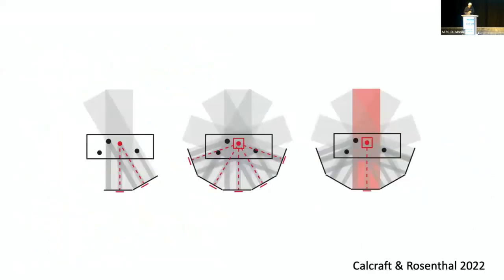Okay, now this is moving from the idea of these tilt pairs. We know there's an increasing focus on tomography, and of course there we're recording many images of the specimen, and in many instances, doing tomography and single particle is informative on some of the validation issues. In addition, there are hybrid schemes where you include, in addition to the tilt series, an extra high dose image just flat on, which might provide different sorts of information. And just for our enthusiasm for all of these new approaches, Tom Calcraft, my student, and I wrote a little review on this.